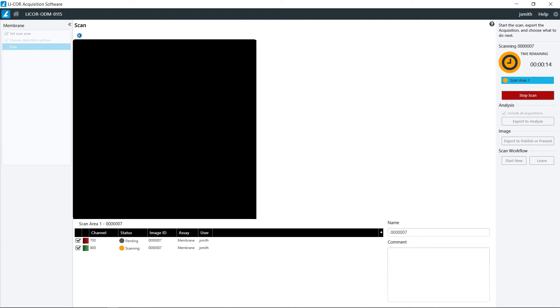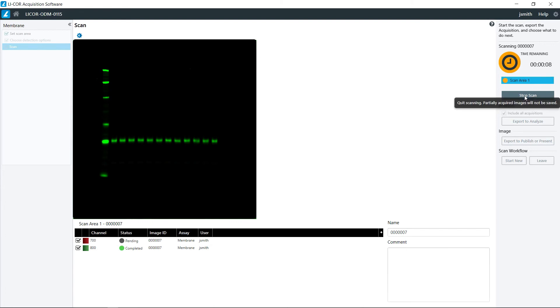The image does come up as it's being acquired and it gives you the scan time and scan remaining time right here. If you do notice that anything is wrong with the acquisition, you can click stop scan at that point.